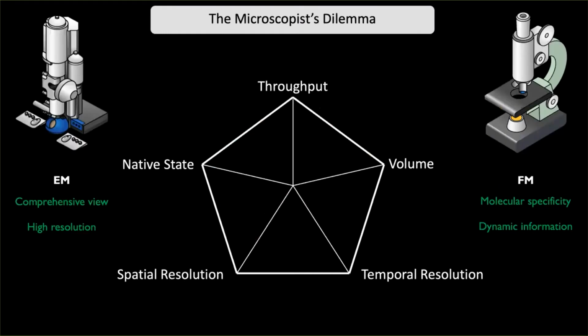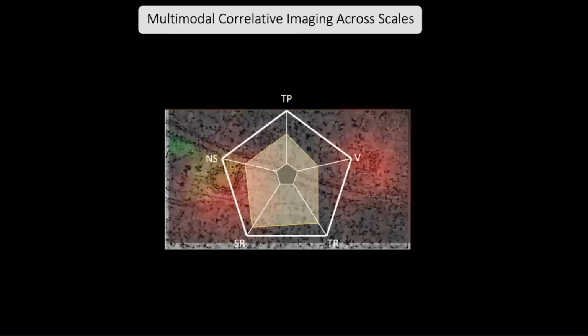Okay, so coming back to this, let's try to analyze together what the compromises of this method are relative to other methods. Since the sample is fixed to begin with, the temporal resolution is not the maximum.